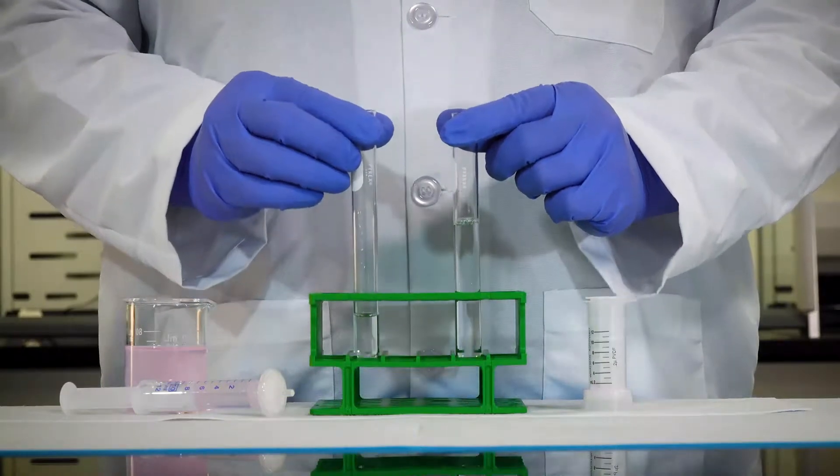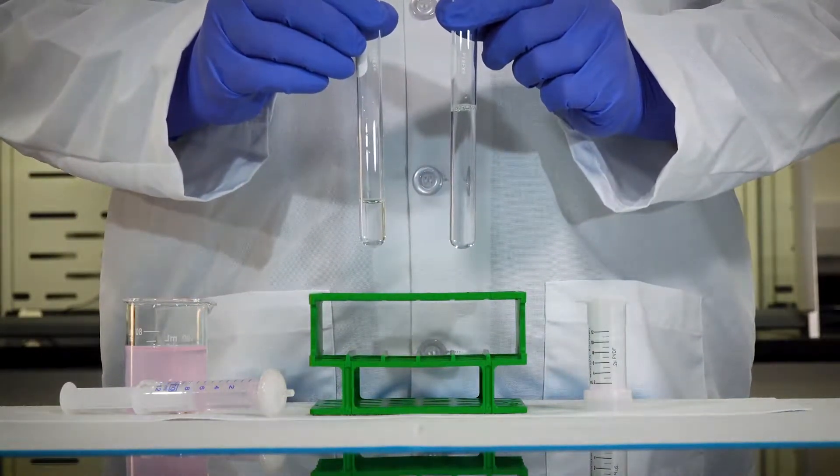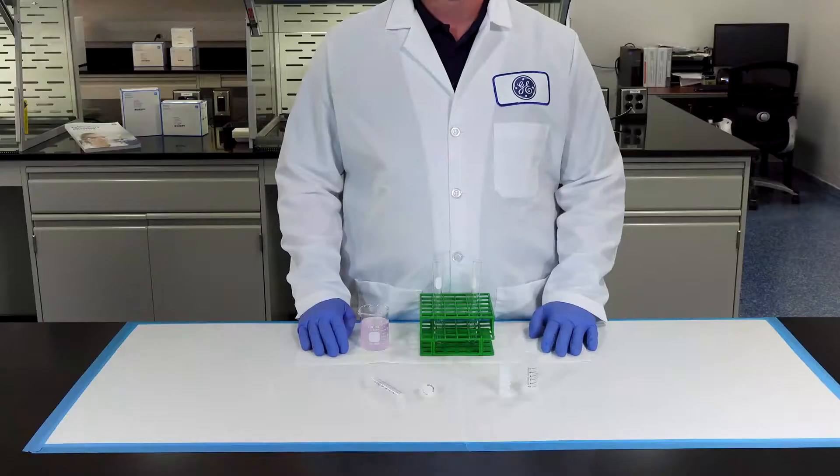Both devices will produce a filtered sample ready for the next step in your process. Let's focus on what's the difference between these two designs.